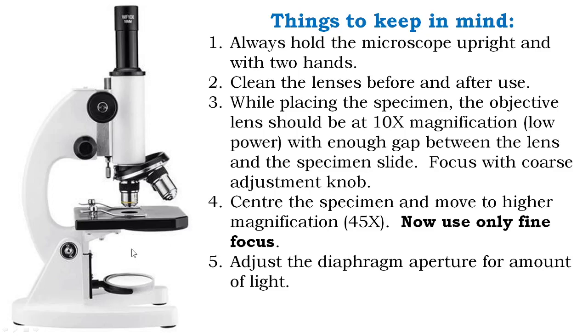Now you have to draw the diagram and you have to write down aim, objective, objectives che, any principles che, and then you have to draw the diagram and then you have to write the precautions of using the microscope.